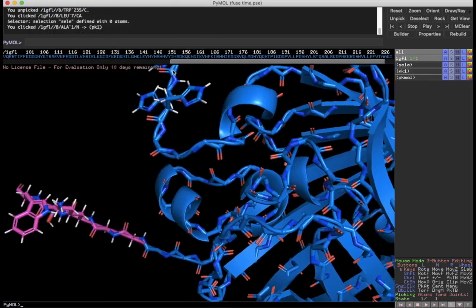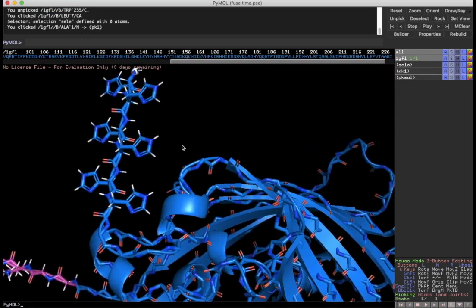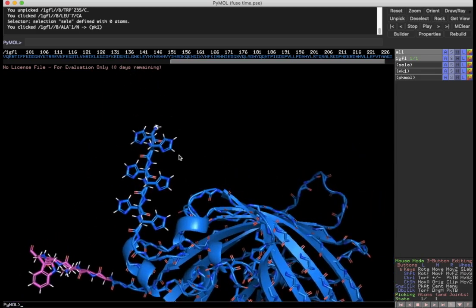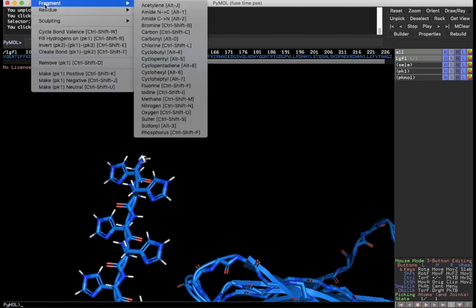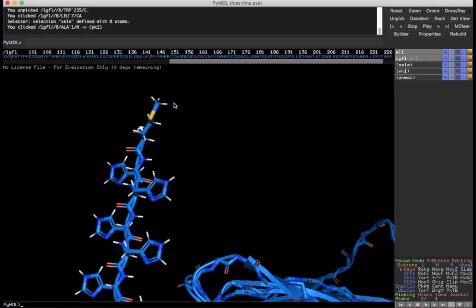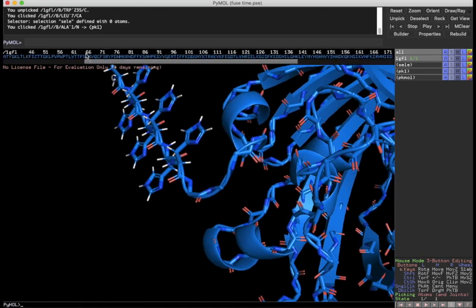6. And you might recall that at the beginning of proteins, you always need to have a methionine there. And so if you were to create this protein in real life, you would have to have a methionine ahead of your polyhistidine tag, right? Because the methionine is the start codon. So I'm going to go ahead and now add a methionine here. There we go. So this, and let's look again here. Let's go back to the beginning.